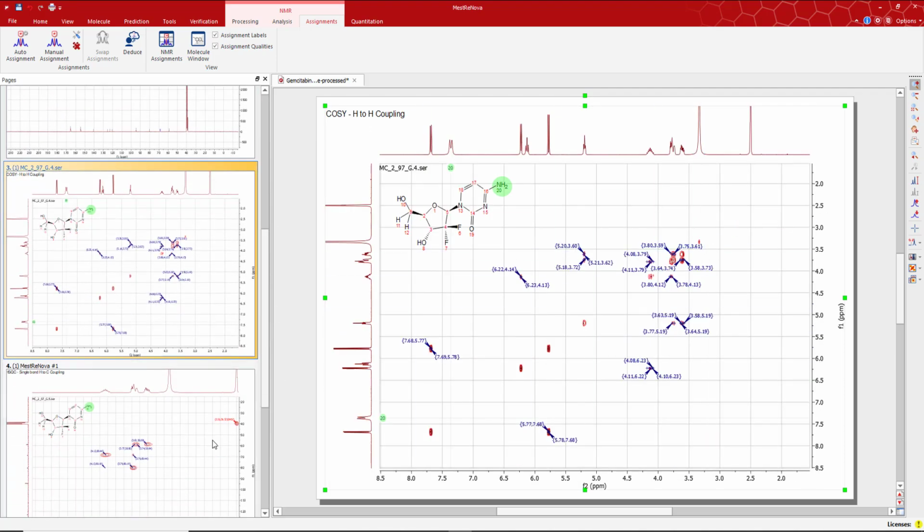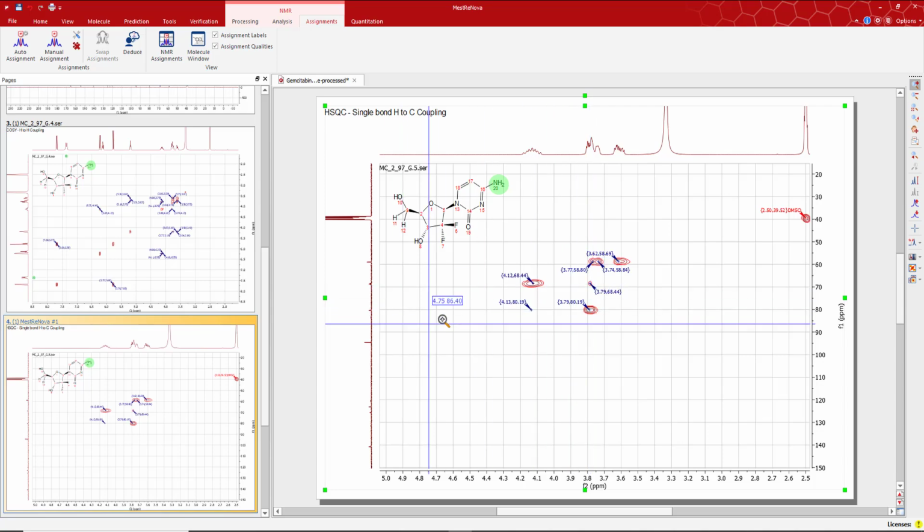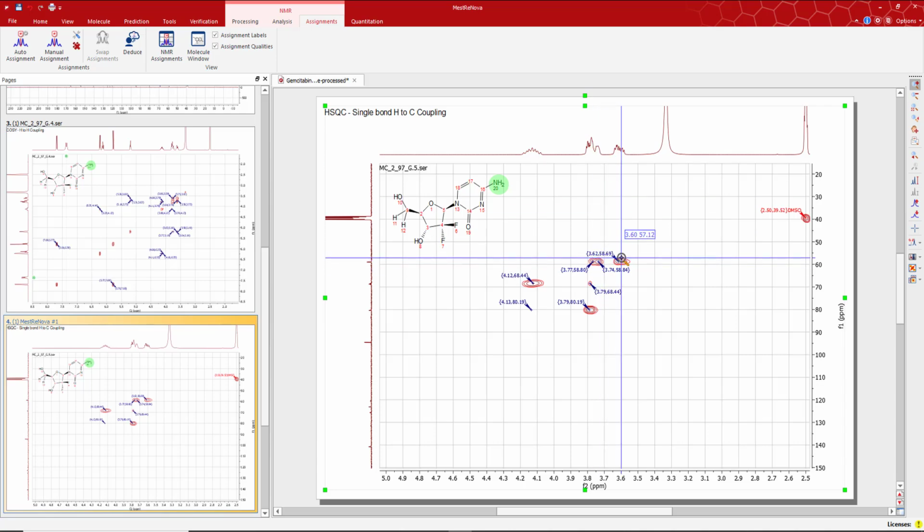So we're going to go back to the HSQC. We're just going to double check. So the more downfield side of that overlapping set of signals is a 1H on some carbon somewhere. We don't know yet, but we know that the more upfield side of that signal, going by this, and this 1H multiplet over here are our diastereotopics, because they are the only two protons on a single carbon, this carbon here at about 58 ppm.